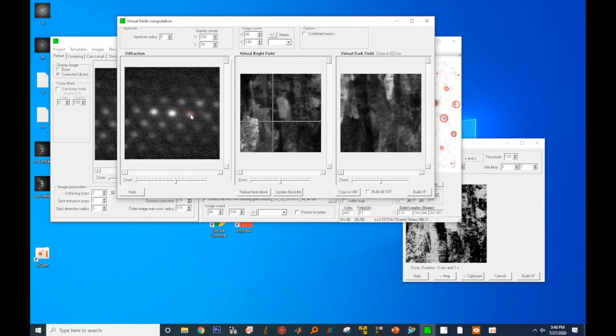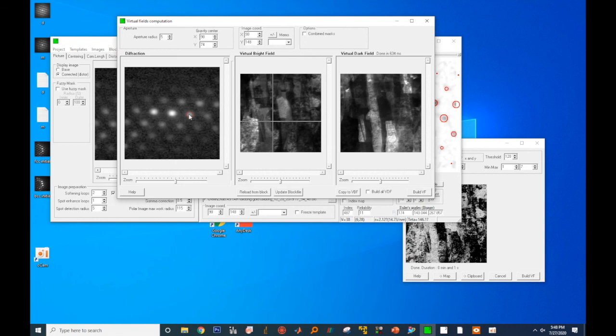In virtual dark field image, for the polycrystalline sample, only the grains contributing to that diffraction spot will show up.